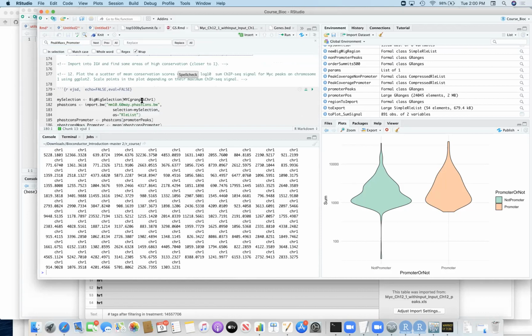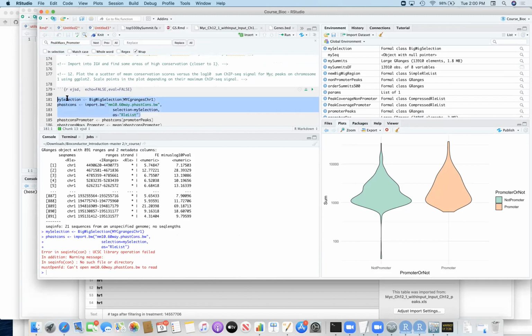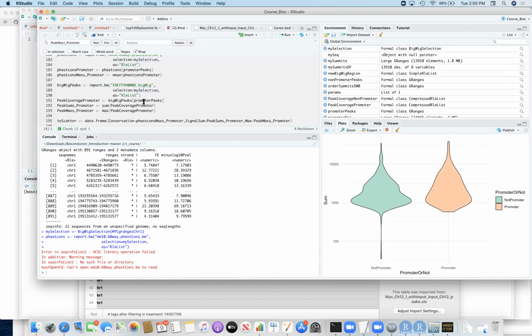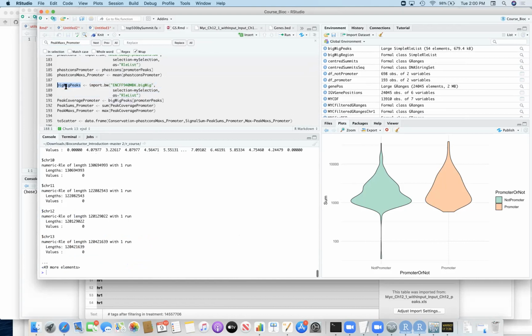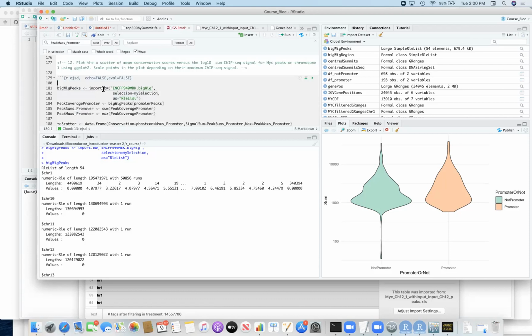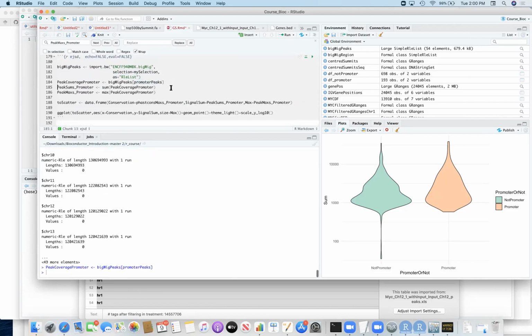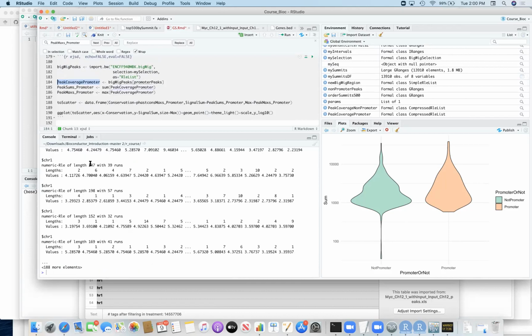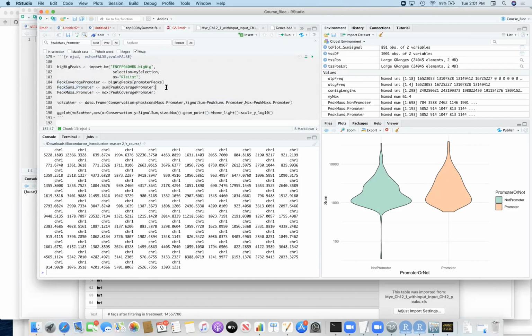Okay, so we have our GRanges here. We can actually get just the signal over our GRanges. Oh, no such file. Oh, right, this is actually a different bit. Here we go. So we can import our bigwigs over our previous GRanges peaks here. We've removed an exercise at some point. So if I wanted to get just the promoter peaks from this, I can get just the coverage over these peaks. I can get the sum, so I can get the total sum of signal in these peaks.